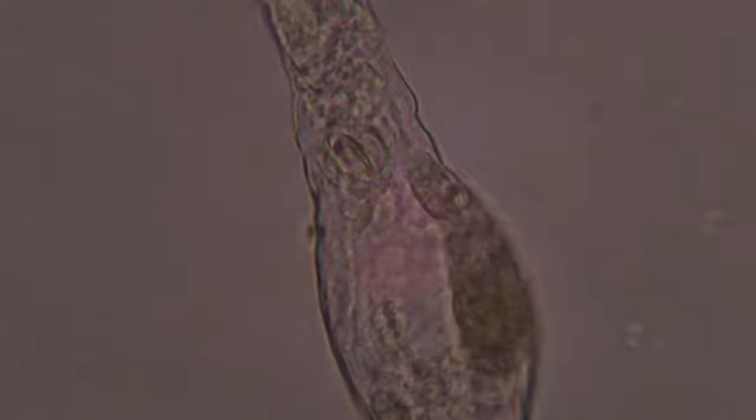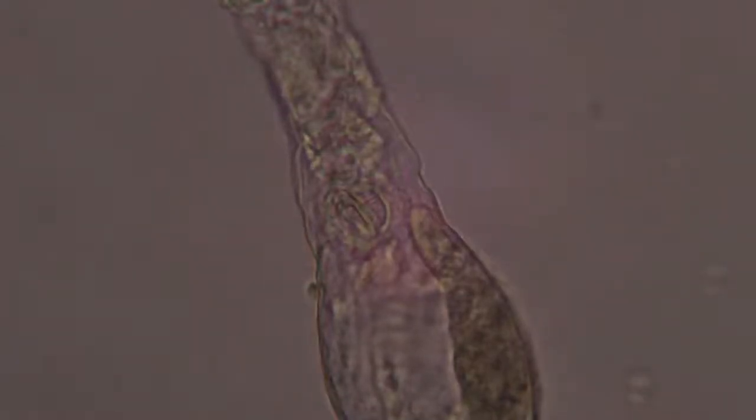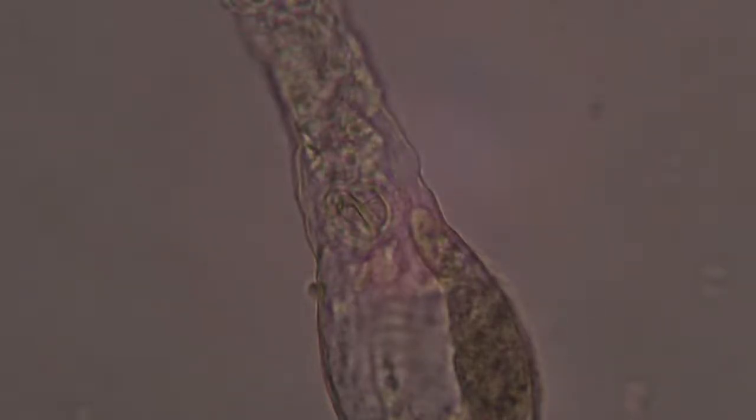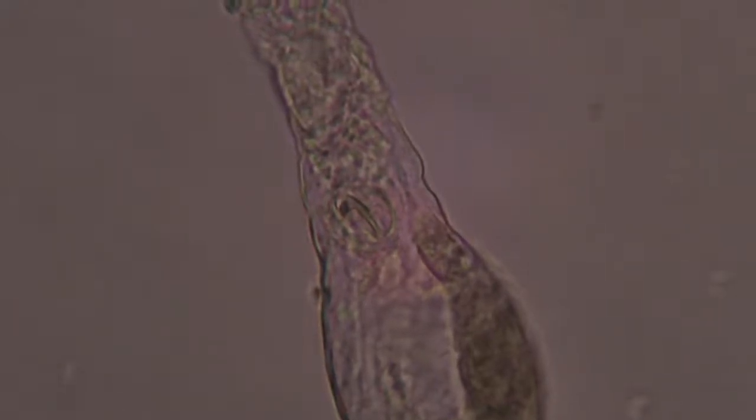So, better view of the mastax there. And at the bottom is where the foot is normally located, but it looks messed up and it's already got stuff pouring out of it, like it's already ruptured. And I do see some little wiggly bacteria at the base, so the bacteria have already found it since it's dead. See those little wiggling dots at the base? Let me move down a little bit, you can see it better. Little black dots.